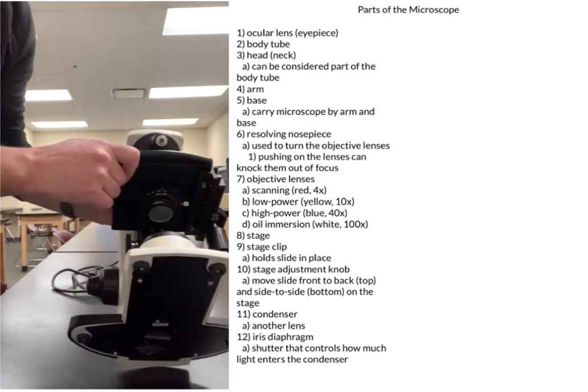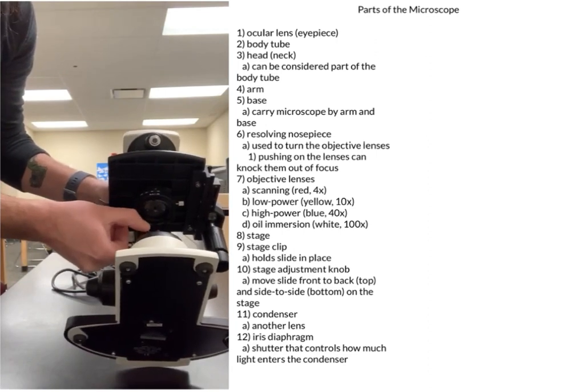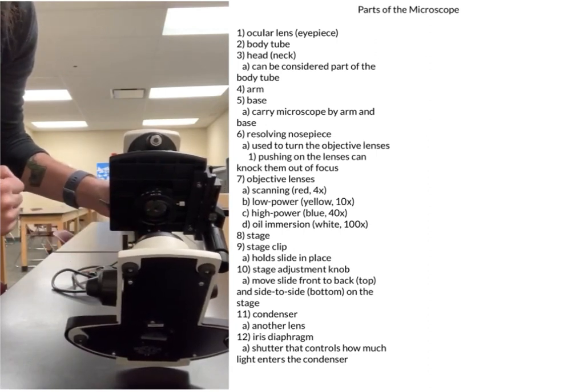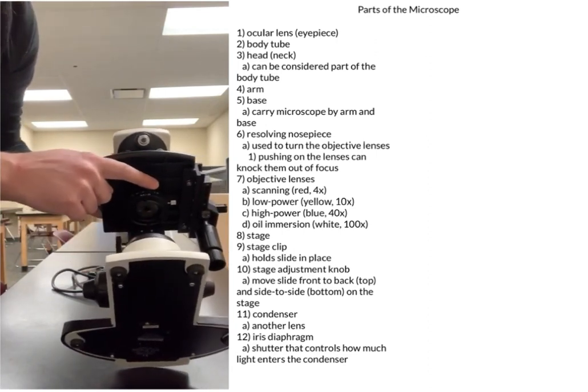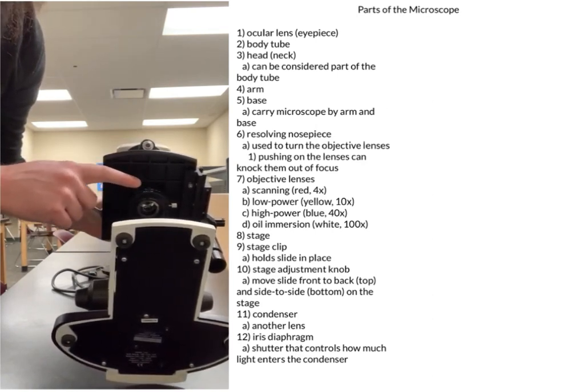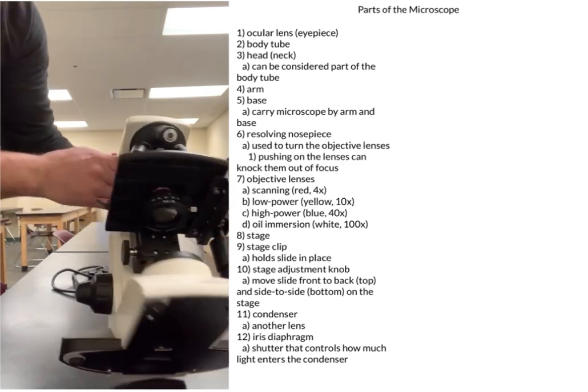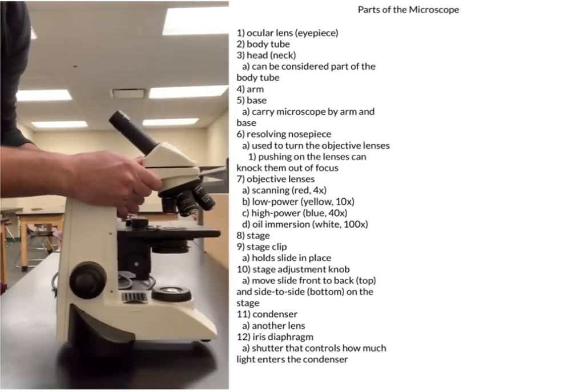So to kind of show that, if we actually tilt our microscope, we can take out this piece here. Whoops. And we can sort of see that shutter open and close like that. I might have to fish that piece out here in a little bit. All right, let's take this and put it back down here.